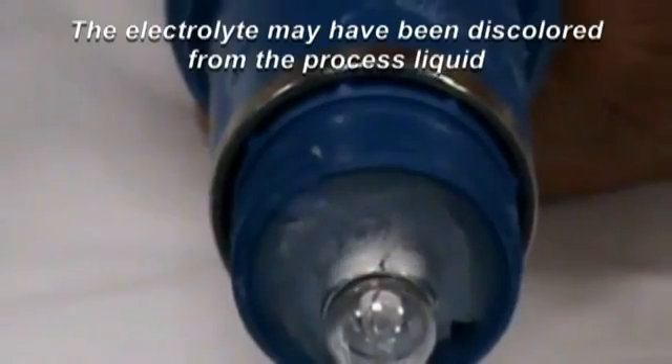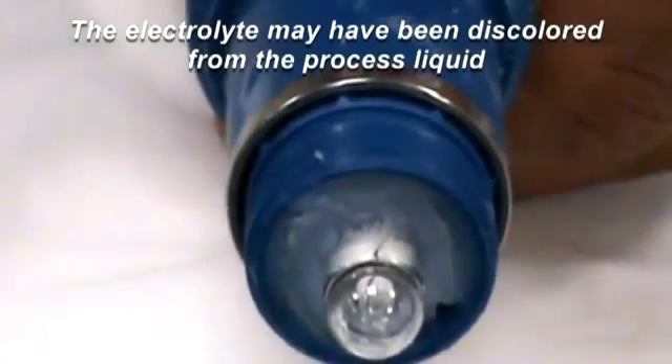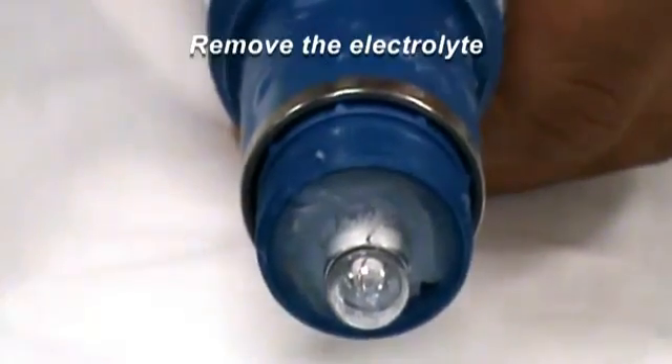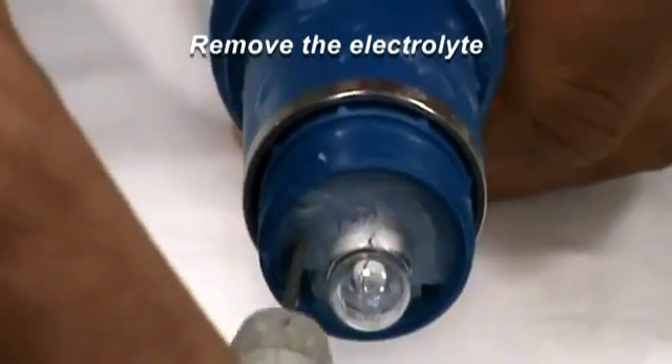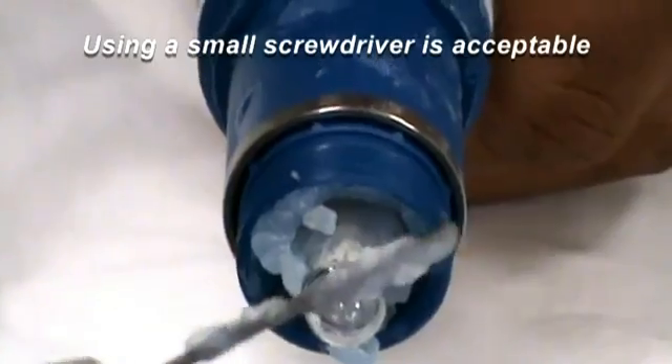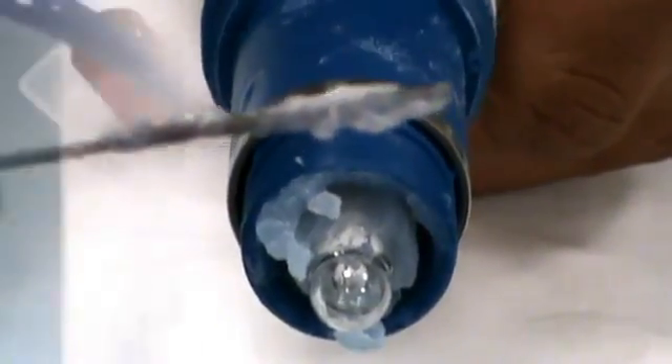The electrolyte may have been discolored from the process liquid, so it might not be the same color as you see here. Remove the electrolyte from the electrolyte chamber by shaking it out or wiping it out. Don't be afraid to use a small screwdriver to assist you with this step.